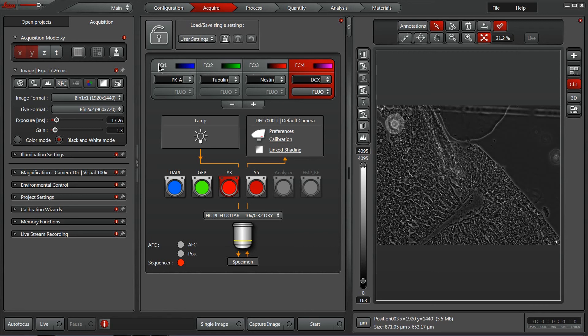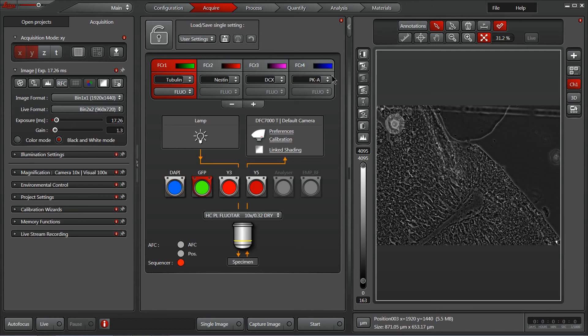I always prefer to do Dappi last, however. Since the UV light used to excite Dappi can also excite other fluorophores, it also can photoconvert fluorophores or aid in bleaching of fluorophores. So we were always taught in my lab to image Dappi last.